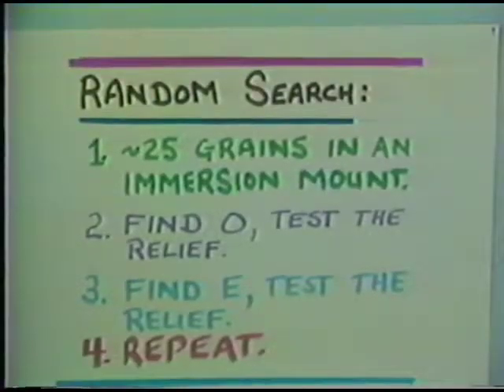Okay, so what do you do in a random search? You make an immersion mount, and the first element of the immersion mount is that it has approximately 25 grains, and we use a small cover glass and grains that are relatively fine grain, something on the order of 50 to 100 mesh in terms of their grain size.